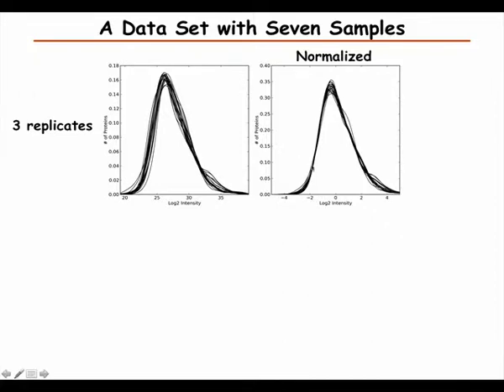So what we can do is normalize it. One way is to make all the medians the same, or the means, but usually it's better to choose the medians, and then set the standard deviation to 1. Then you see that they align much better, but not perfectly.